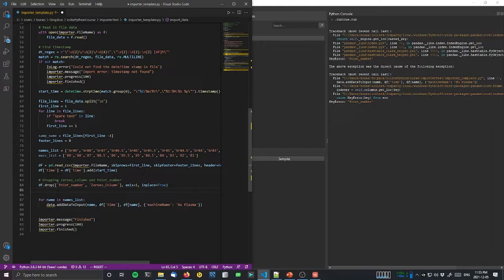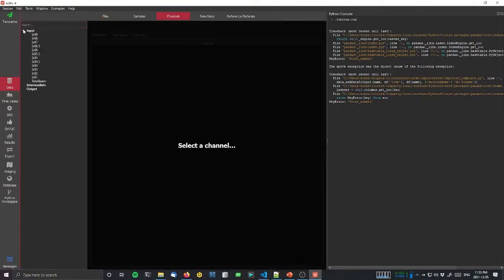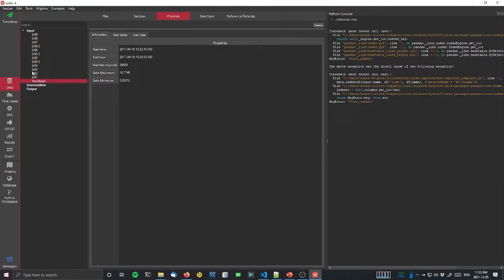So we'll say names list dot remove, and we'll have to do this one at a time. Point underscore number, and copy that, and let's just copy what's in here. Okay, so we'll now get rid of those out of that list. So now we should actually be creating channels. And let's just see if it did create some channels. And yep, we did create some channels before, and it only bombed out when it got to the point number, etc.